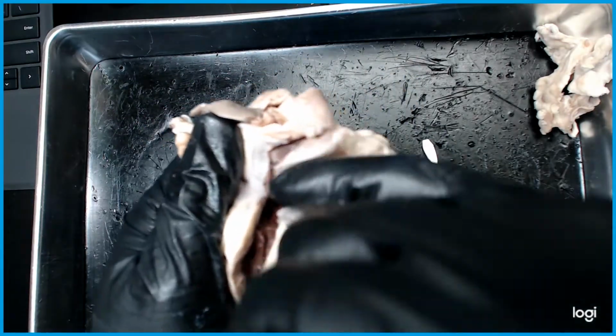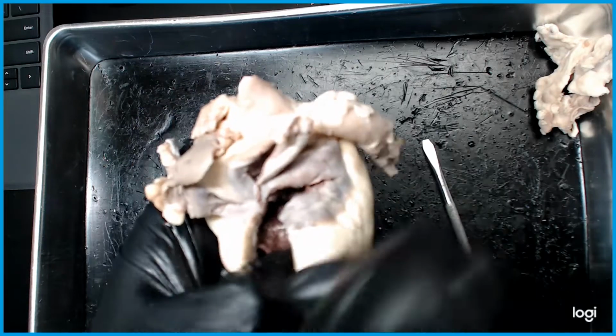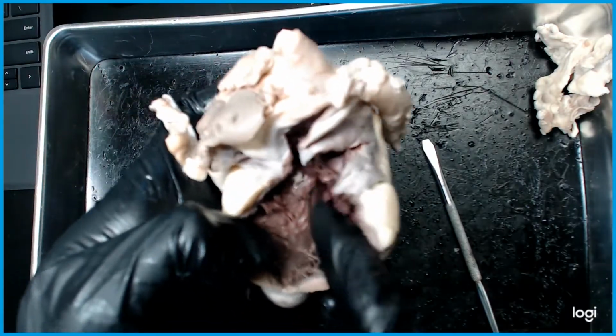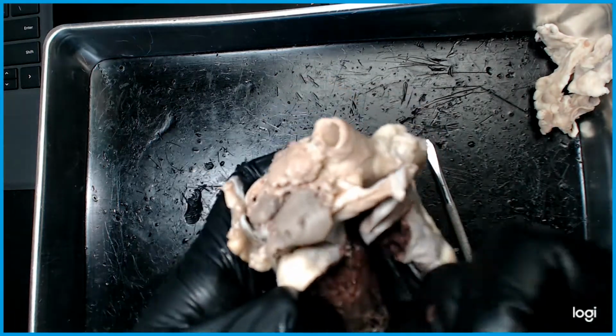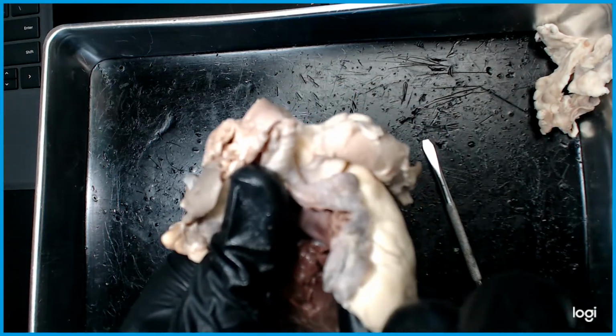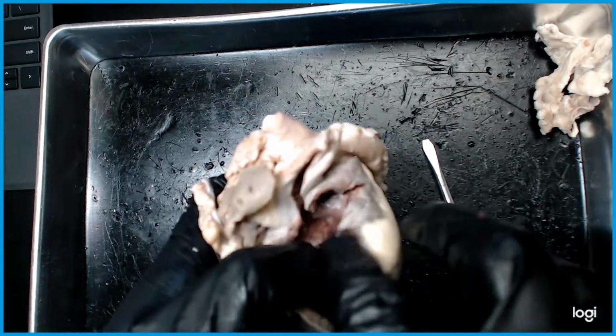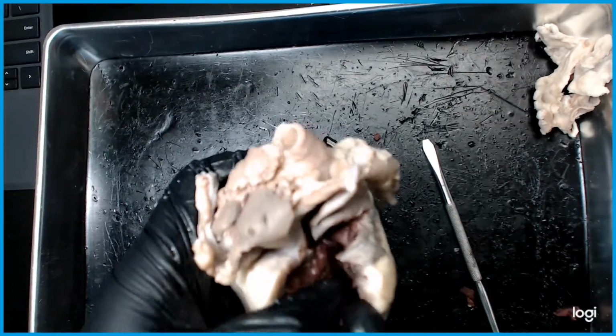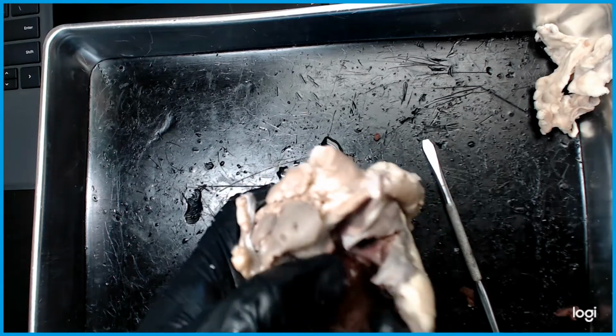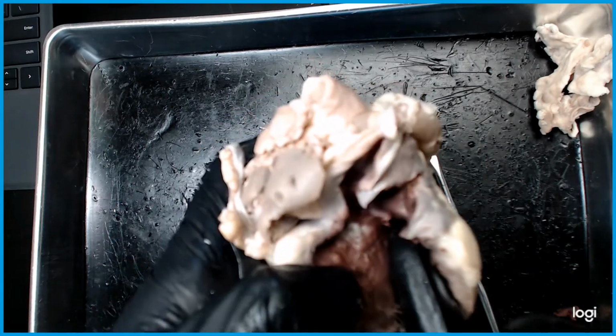The reason we want to dissect the heart this way is we go with the blood flow. So superior and inferior vena cava goes into the right atrium, from the right atrium through the tricuspid valve into the right ventricle. Right ventricle needs to go through a pulmonary semilunar valve, and that pulmonary semilunar valve will lead us to the pulmonary trunk. From the pulmonary trunk, you have your pulmonary arteries.